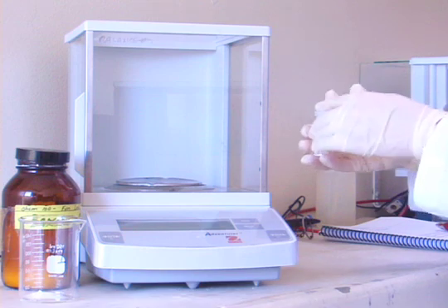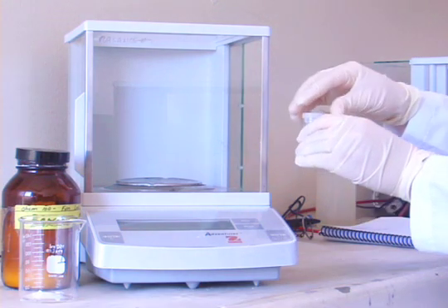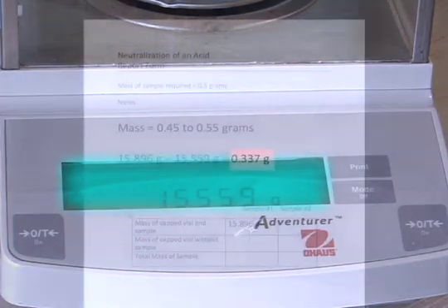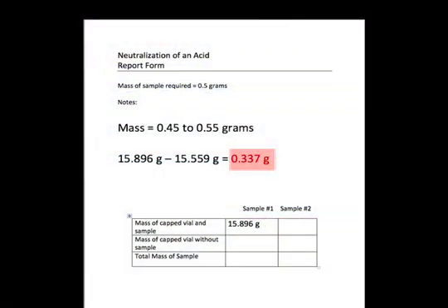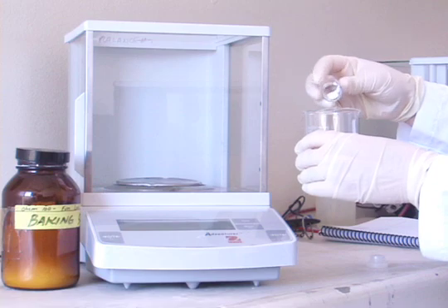Re-weigh the vial containing the remainder of the sample on the scale: 15.559 grams. Since the amount of the missing mass is only 0.337 grams, we add more solid to the beaker and re-weigh the vial until the sample size is acceptable.